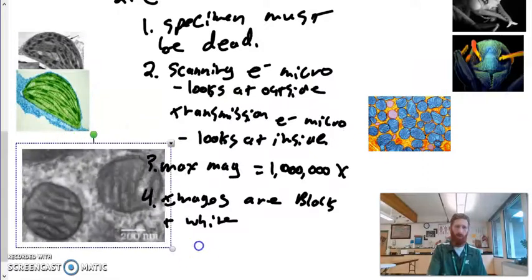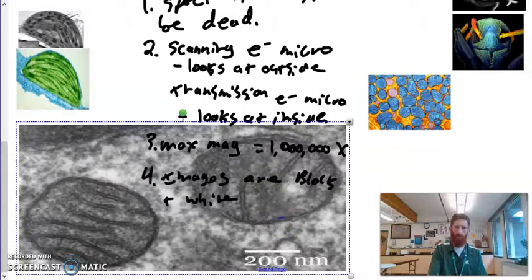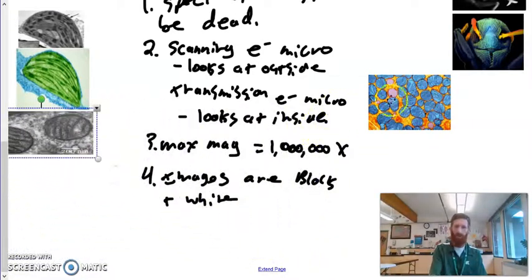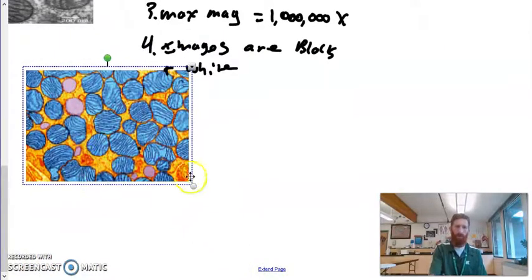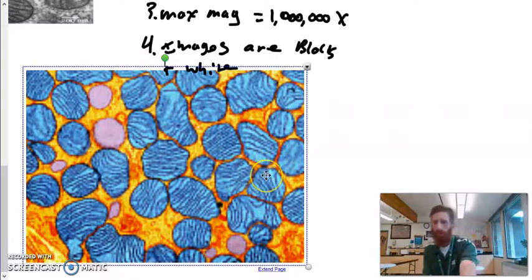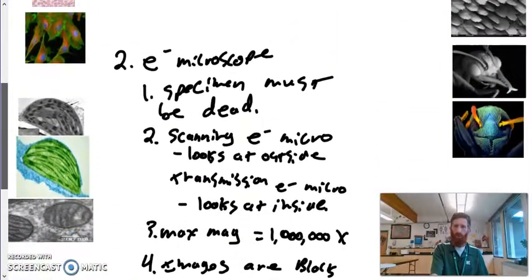We'll go now to the opposite of chloroplast. So this is mitochondria, right? The inside of mitochondria under the transmission electron microscope, because it's the inside. And then here's the false colored version of mitochondria, which are photoshopped to make things stand out. So that's mitochondria, the powerhouse of the cell, right? And here, we'll just delete that so we can move on quickly and efficiently.